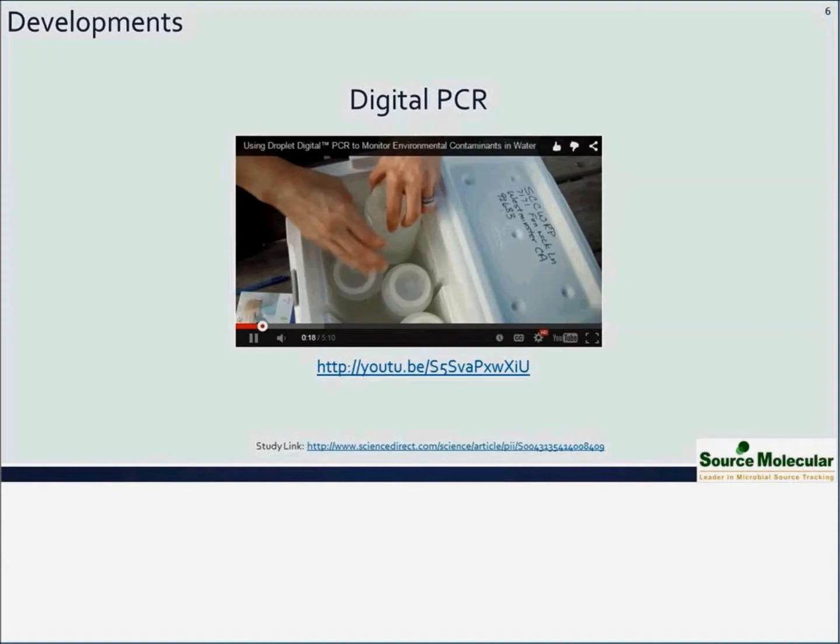So we took the initiative to receive a loaner for 6 months, and we did a comparison study saying, can we reproduce the same results that SCCWRP can produce in their laboratory? Is there consistency with data, which can be a challenge with qPCR? And there was. And so we will be, hopefully in the next year, publishing the results of that study.